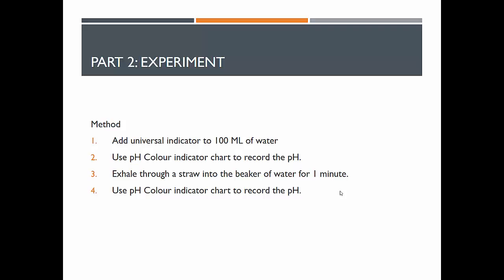After a minute you are going to use that color indicator chart again to record the pH. It is a very, very straightforward experiment. It is a very quick experiment, so we will not be spending too much time holding your hand doing this. It is a very simple experiment.